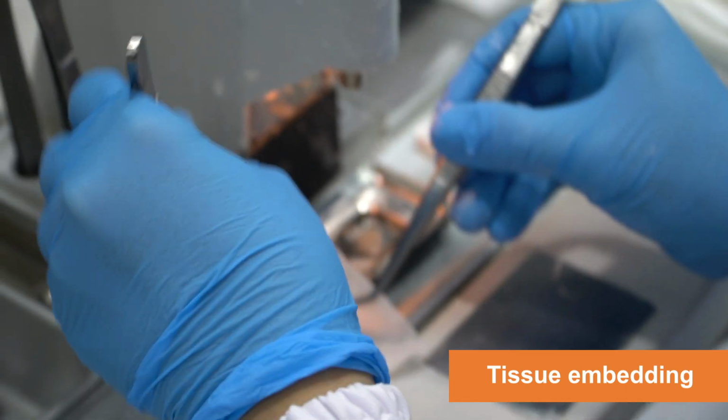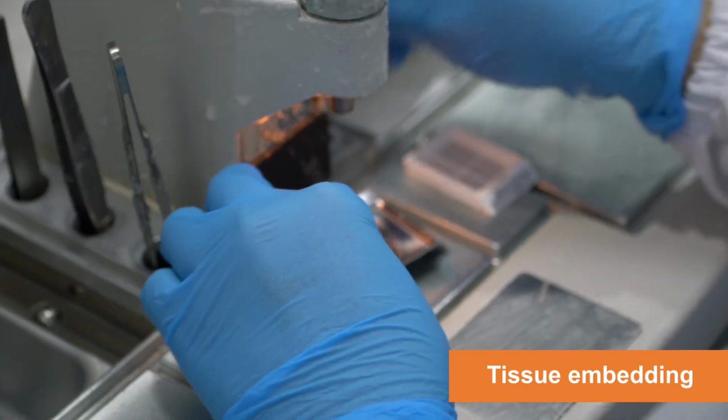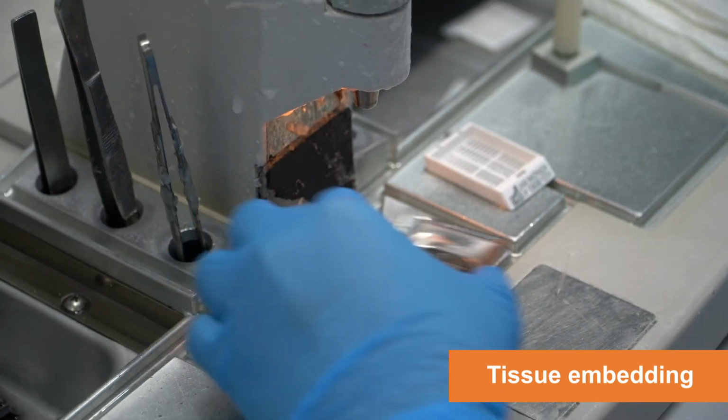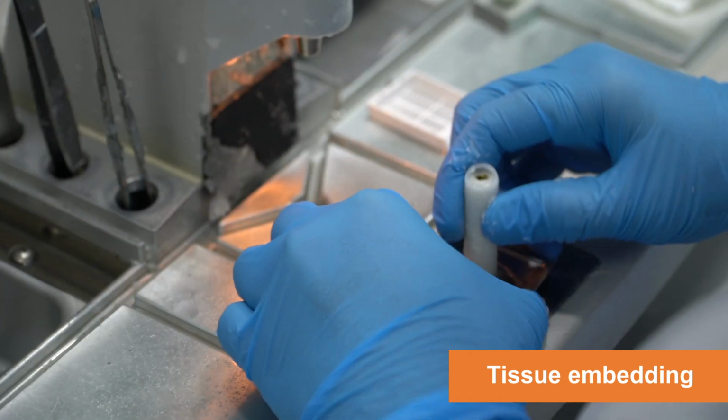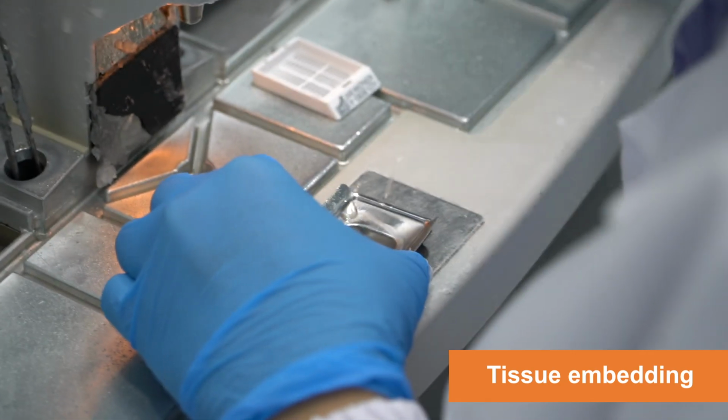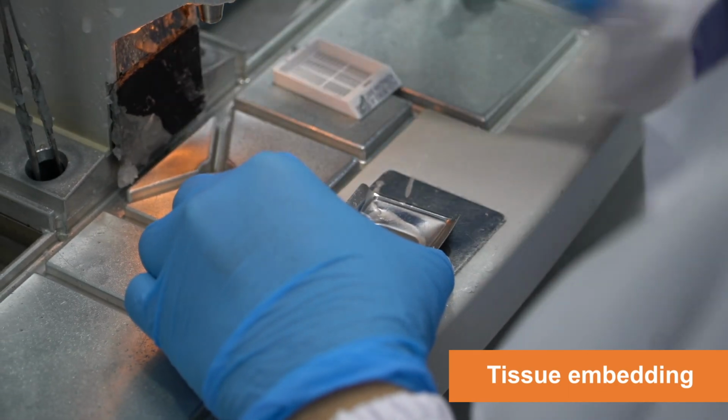After tissue processing, the specimen is embedded in wax for section cutting. In an embedding station, it's placed in a mold with molten wax, topped with a cassette, and cooled to form a block ready for cutting.